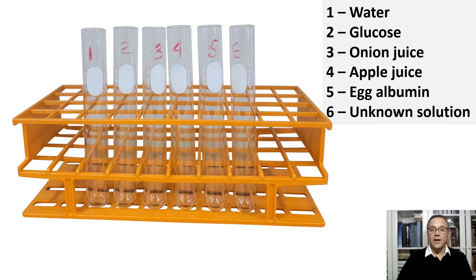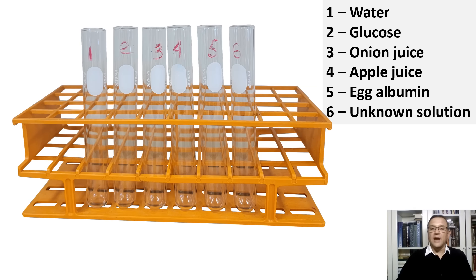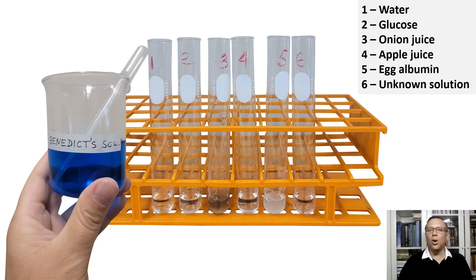In the next three test tubes, we will add the same amount of tested food. I will put onion in test tube three, apple juice in test tube four, and egg albumin in test tube five. In test tube six, I will add an unknown solution. At the end of the experiment, by comparing the colors, you will need to determine what the unknown solution is — water, glucose, onion juice, apple juice, or egg albumin. Here are all our test tubes filled with various solutions, controls and food samples. Which of these foods will contain reducing sugars?